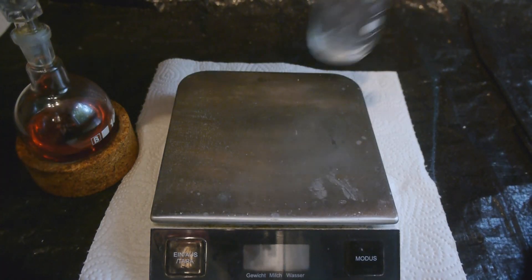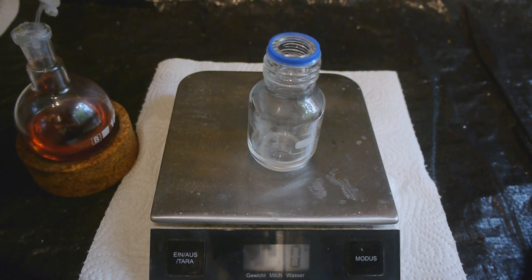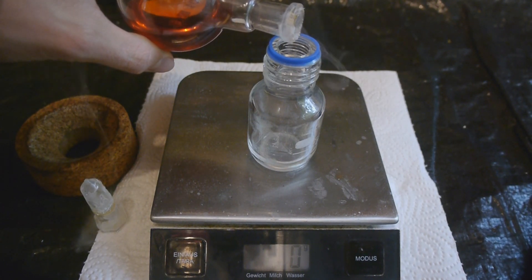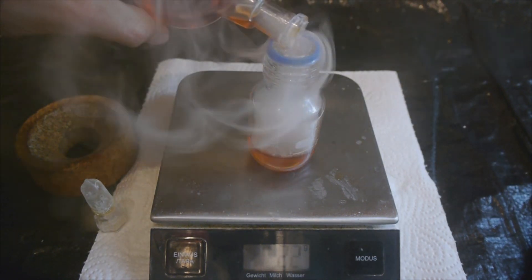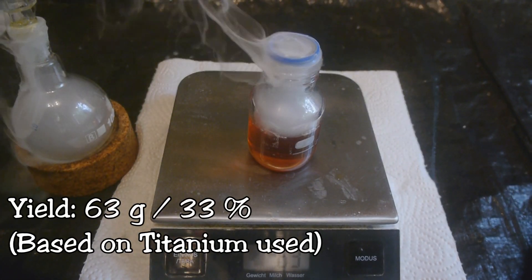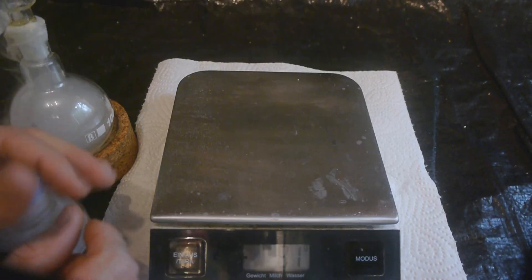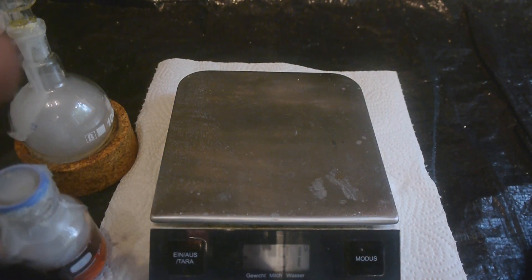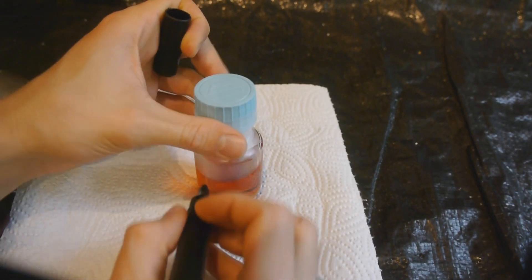Now it's time to measure the yield. So I have here a carefully dried flask. Now let's pour everything in there. The yield is 63 grams. I've got some on my hand — great. Okay, let's not forget to write on there what's in here.